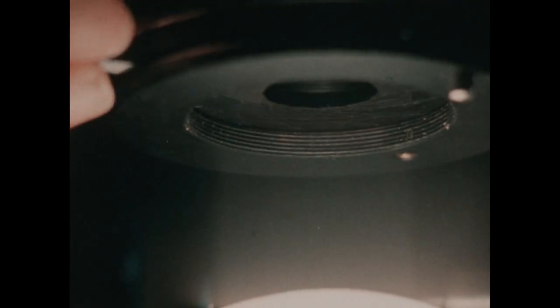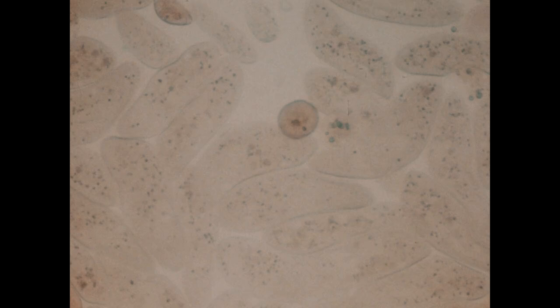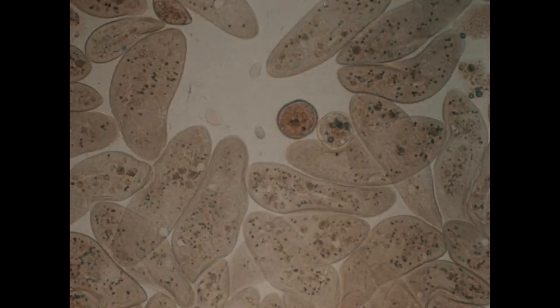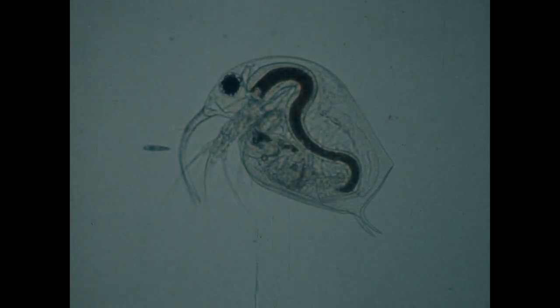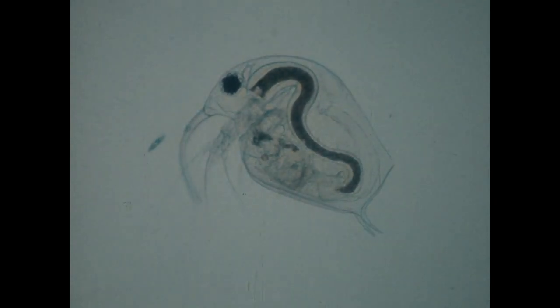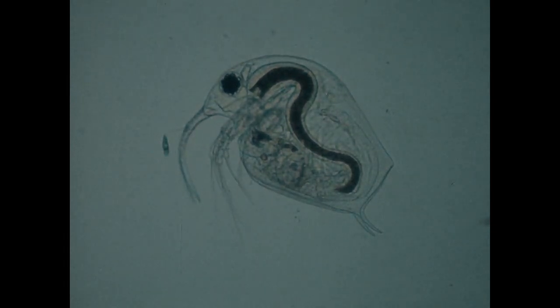When the iris is used to cut out flare, contrast, how the subject stands out against its background, improves. Further closing of the iris produces more contrast, but at the expense of resolution. This relationship between contrast and resolution, controlled by the iris, gives you some choices when viewing clear, unstained specimens.